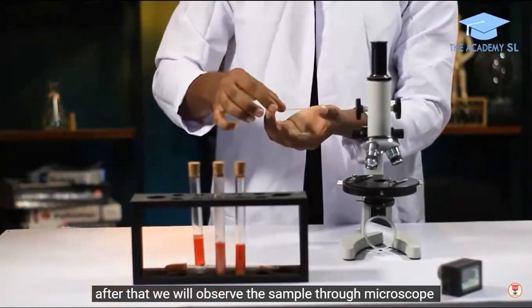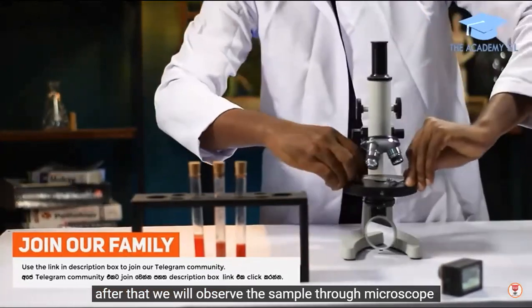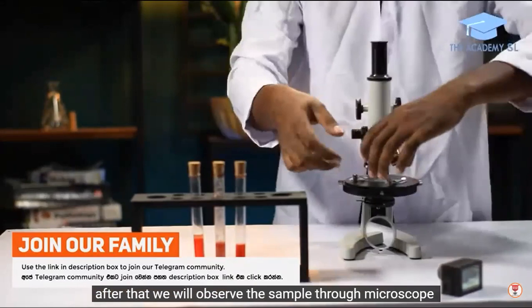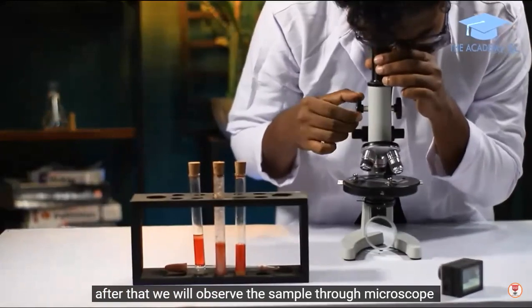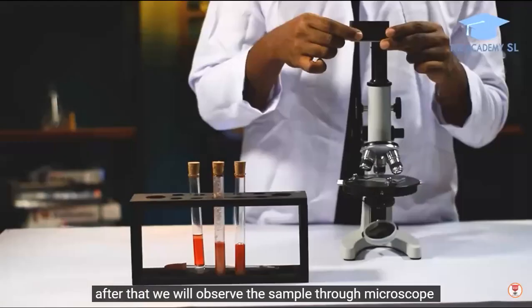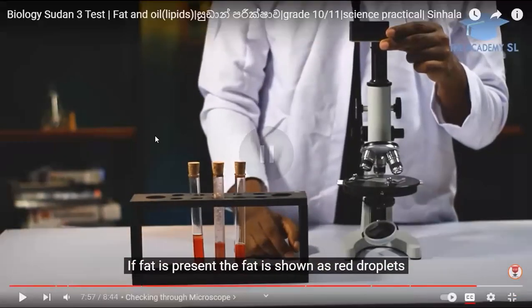Observing it under the microscope. He has a nice camera called Pro 7.